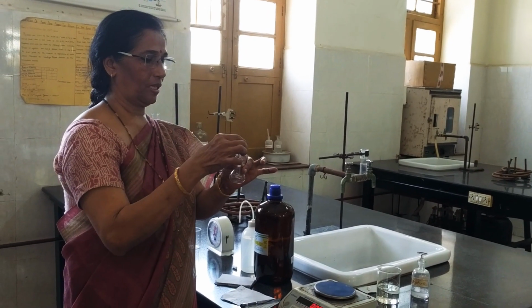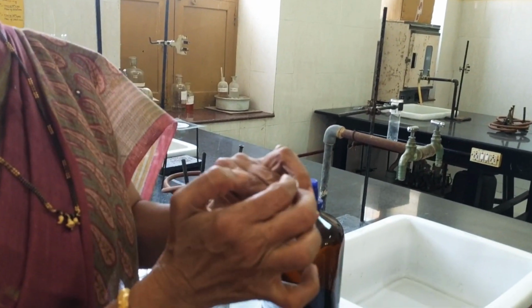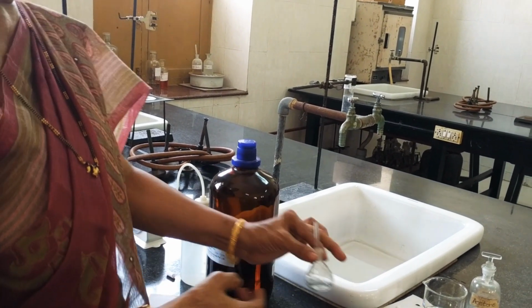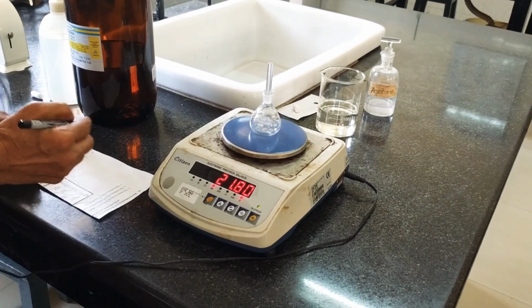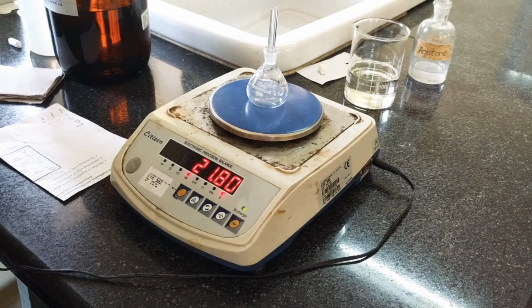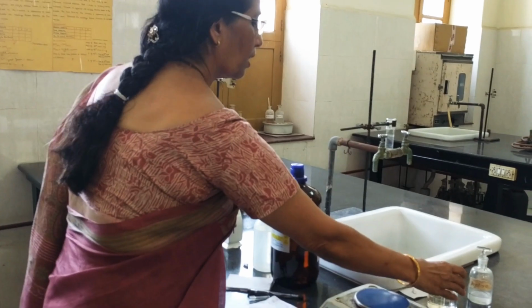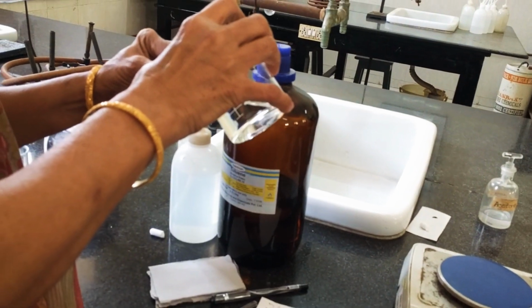This is the bottle. You can see that it has a lid. Not only a lid, there is a small hole in it, and the liquid can come up to that top due to capillary action. Now let me take the initial mass, place it on the balance, and note down the mass, which is 21.80 grams. Now I am going to fill in the organic liquid for which I need to determine the density.